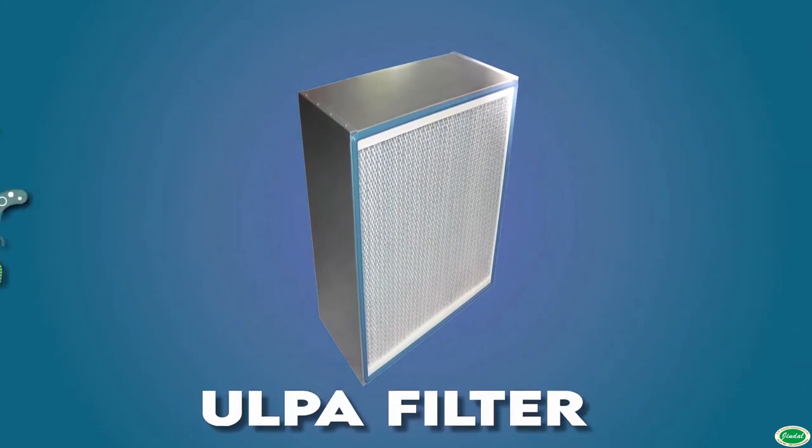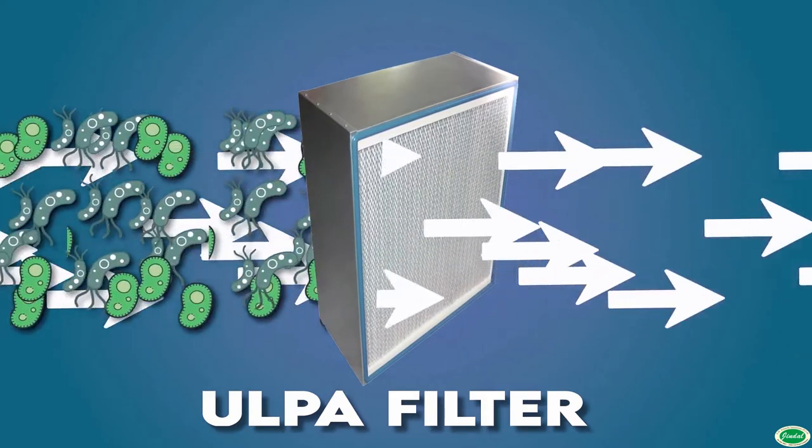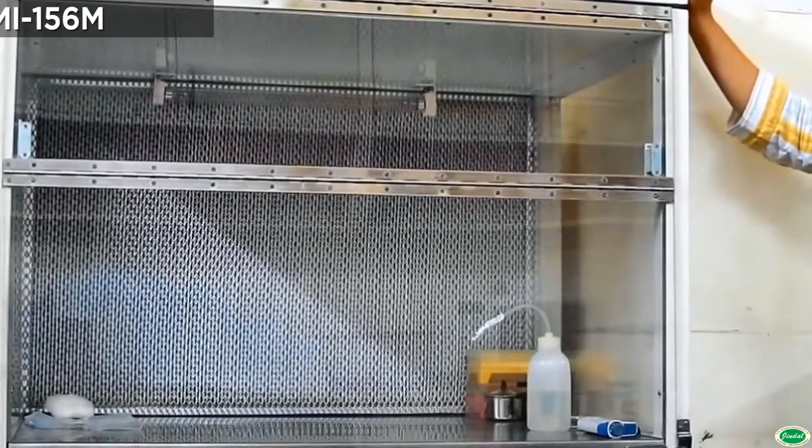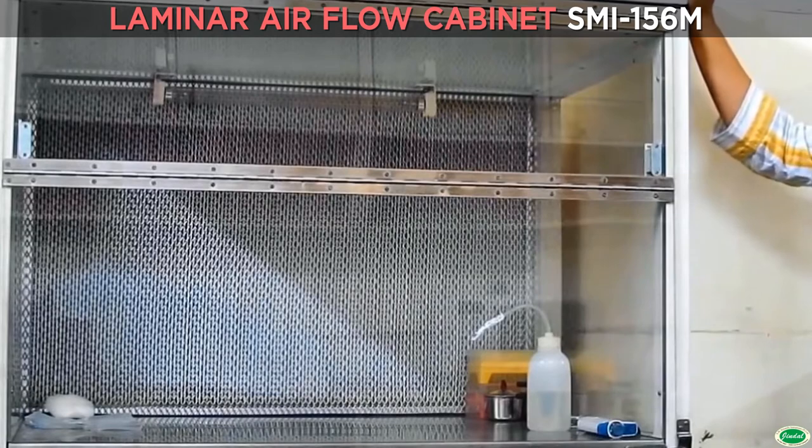Laminar flow principle involves double filtration of air. Atmospheric air is drawn through pre-filter and is made to pass through highly effective HEPA filter.